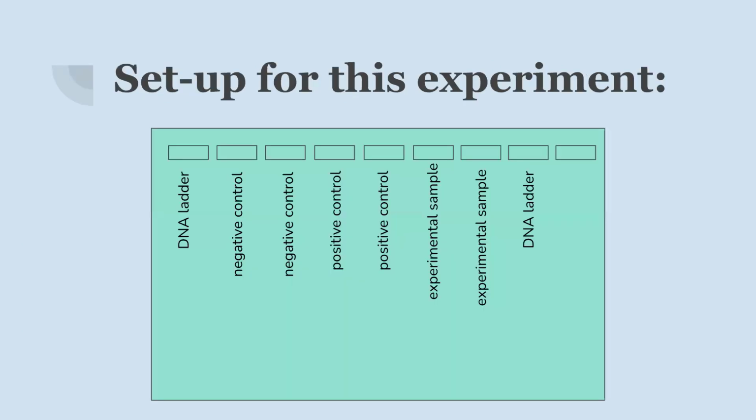So again, the setup for this experiment is that we would want you to have some experience pipetting in a gel well, which is why we would have wanted you to pipette this so much. But the other thing is, if we have 2 negative control samples and 2 positive control samples, and there's contamination, it gives us a better opportunity to be able to see that, right?